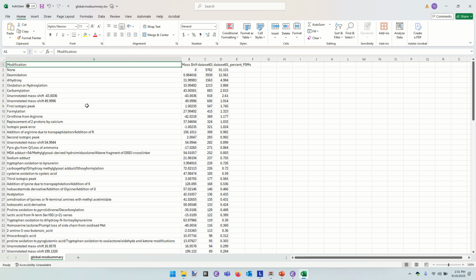Dihydroxy. Here we have a gain of 32. So does anyone have an idea of what that 32 is going to represent? I mean, the chemistry is spelled out right here. It's a dihydroxy, but what is that? Hydroxy is where you add an alcohol group, and if you replace a proton with that, then you get plus 16.